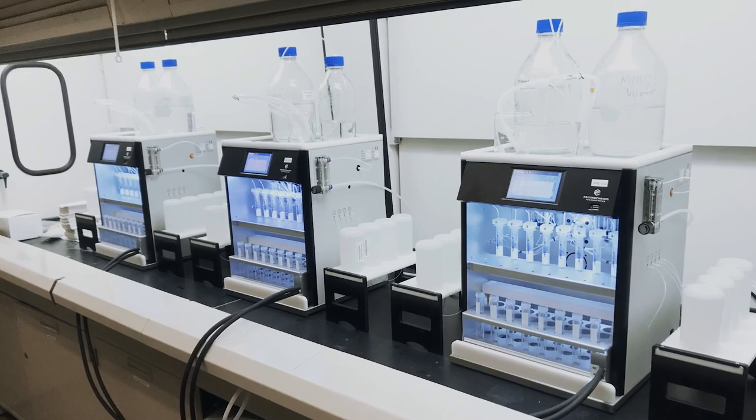No kidding. This small footprint also allows the SPE03 to be placed in a fume hood if required. Now, let's take a look at the main components of the system.